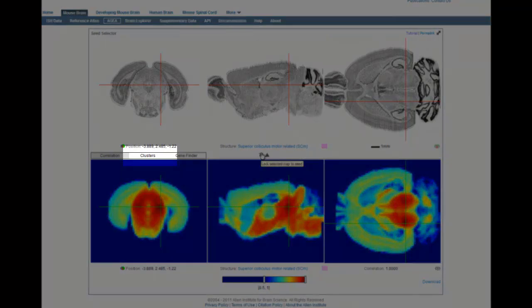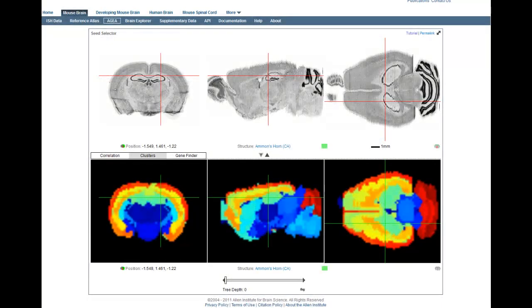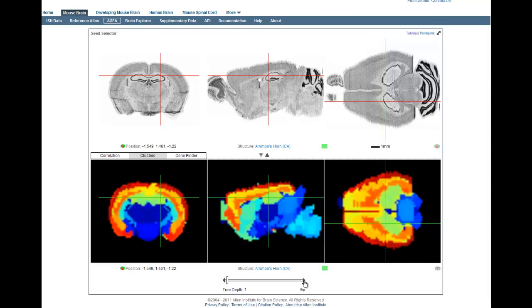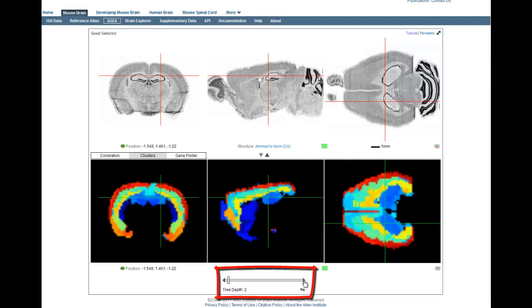The next feature of AGEA is the clusters tool, accessed by clicking on this tab. In clusters mode, the lower panels show a hierarchical organization of the brain based on clustering of the voxel correlation maps. In this view, the voxels are spatially organized as a binary tree, where each voxel is initially assigned to the root node of the tree, and as we descend the tree, each node is bifurcated to achieve maximal dissimilarity.